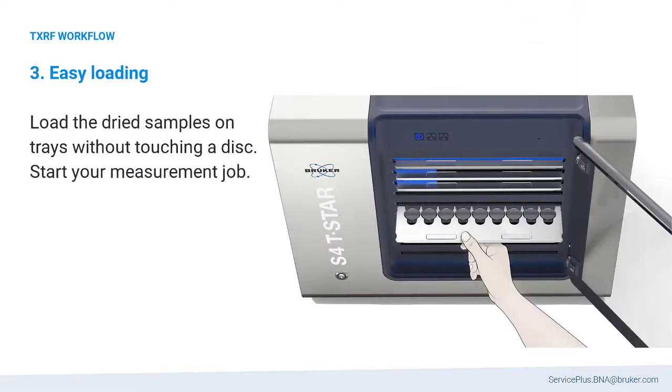Dried samples are directly loaded into the instrument without touching a disc. Subsequently, the measurement can be started.